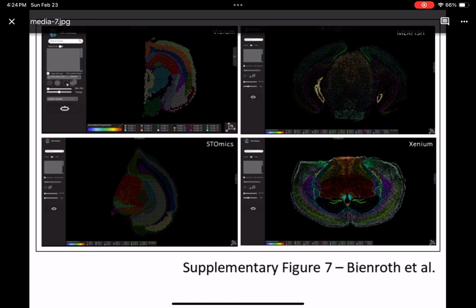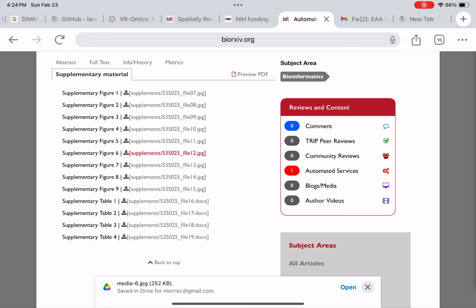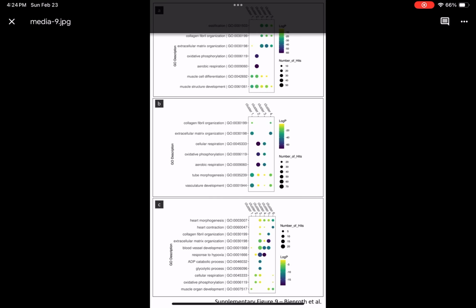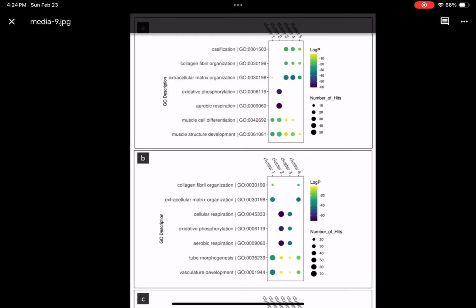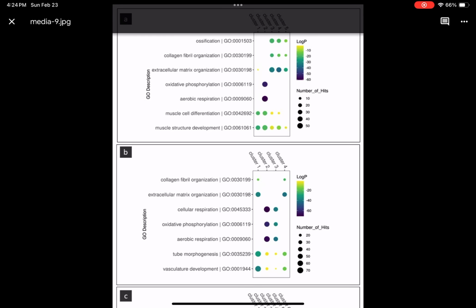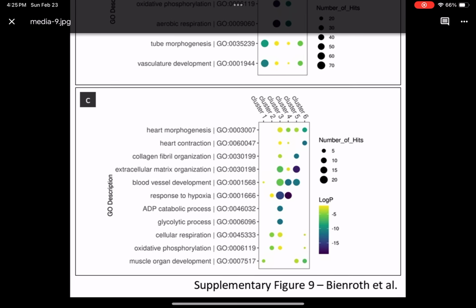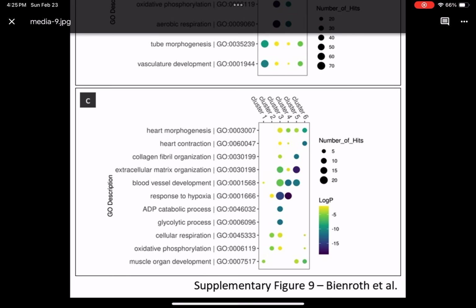Supplementary Figure 9. GO analysis of cardiac rhabdomyomas using Metascape. A. GO results from MCH-TB361 sample 2. B. GO results from MCH-TB361 sample 3. C. GO results from MCH-TB362 multi-slice, co-planar dataset sample 2.